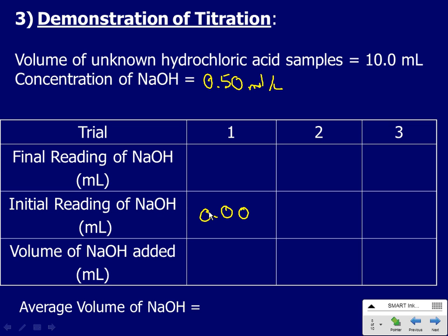Is there any purple? All right, what's going on here? I had the same the other day. I've got the graduation pointing the wrong way. I'm at 6. All right, okay. I would like to see some more purple in there. You'll notice I put a piece of white paper underneath it. I'm questioning my phenolphthalein because last time, and I'm right at 10, it hasn't hardly turned purple at all. Is there any purple getting in there?